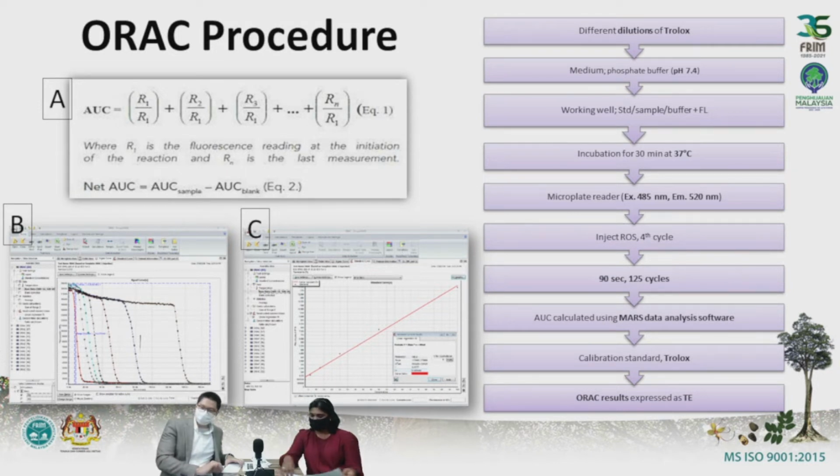Alright, thank you for that, Shalini. I will go back to the earlier point that you made just now about different versions of ORAC assay. So there are ORAC assays that handle hydrophilic samples, then there are ORAC assays that handle lipophilic samples. So in your experience, I assume that handling lipophilic samples sounds a bit more difficult. Is that true? How does that differ actually? Yeah, in terms of sample preparation, definitely it differs because you need a special lipid solubilizer to extract out the lipid soluble antioxidants prior to the testing. Okay, so that's more like a pre-ORAC step. Yes, or prep step in a sense.